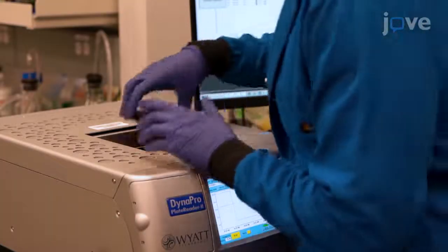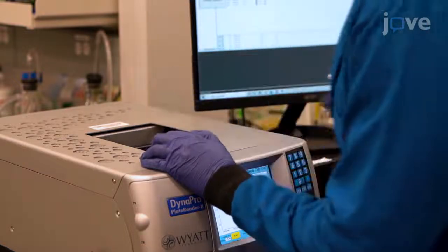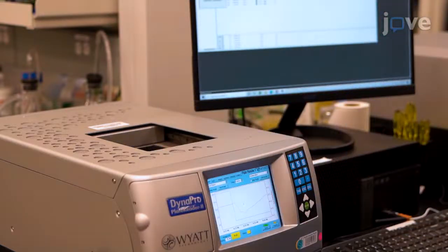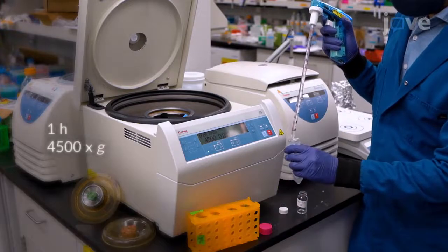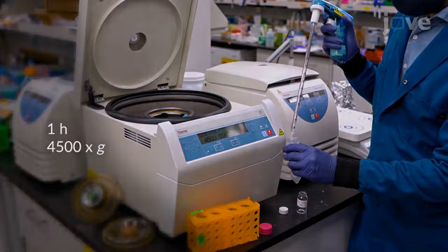Verify the particle size by dynamic light scattering according to standard protocols. Then, transfer the nanoparticle solution into a centrifugal filter unit to concentrate the solution to less than 250 µL.